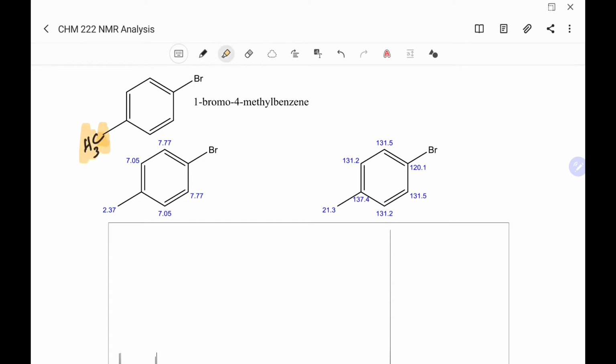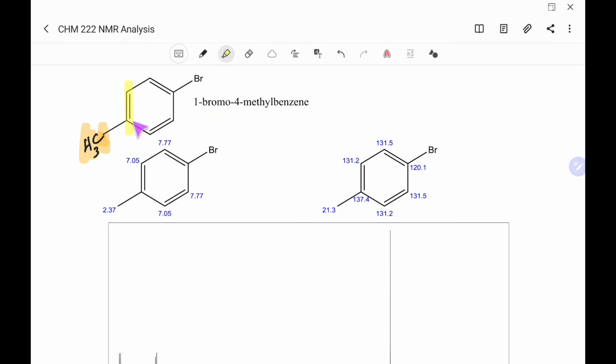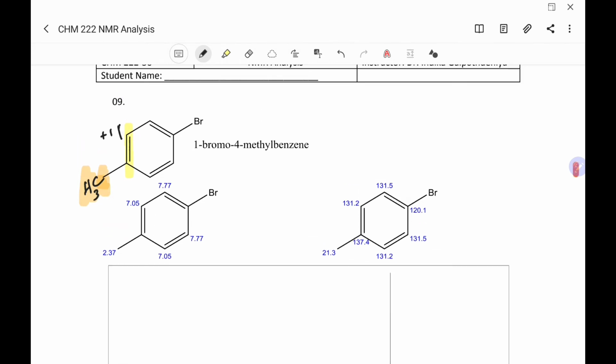Those hydrogens are actually next to a vinylic group. So whenever you have a vinylic group, how much do they add to the chemical shift? It is adding +1 ppm. So the baseline is 1 ppm and you are adding +1, so you are expecting the peak to be around 2 to 3 ppm. That is what you see here.